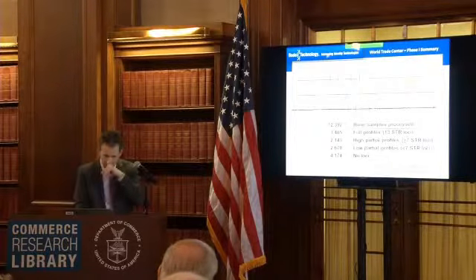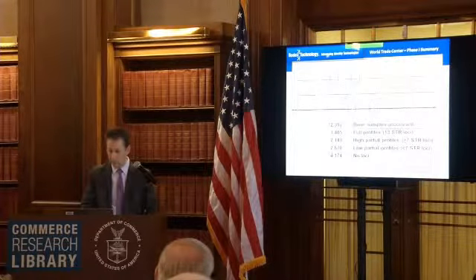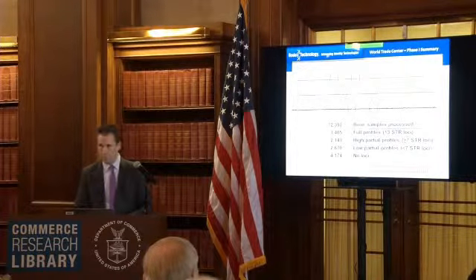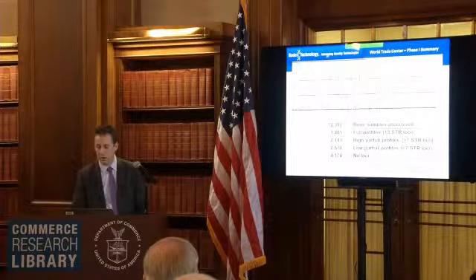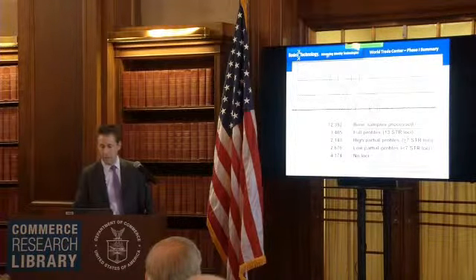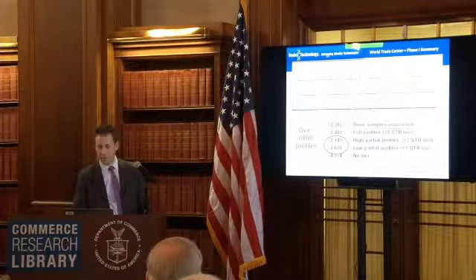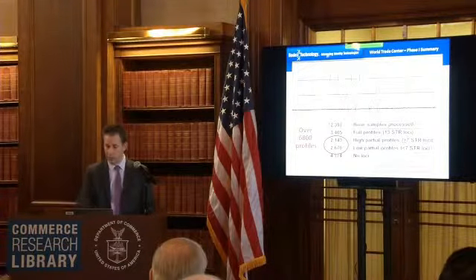So an example I wanted to show here, this is some data that we're allowed to share from Bode Technology, which is down in Virginia, and they were doing some of the bone fragments information that they were getting from the World Trade Center in the mid-2000s. And this is an example of a test where the space I've circled here, that's sort of empty, is where peaks are not showing up because the DNA is degraded. What I have here is over 12,000 bone samples were processed. About 3,400 gave full profiles, which were fine. And then you have this area where you have these high partial or low partial, where you're getting about 7 loci or so. And then sometimes you get no information at all.